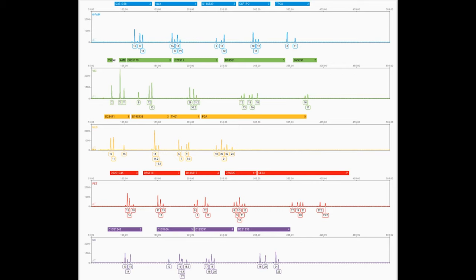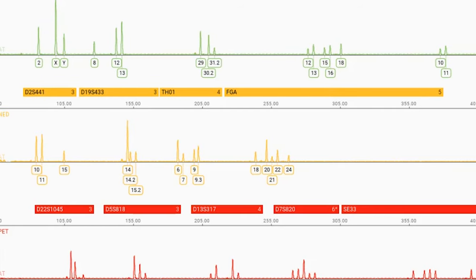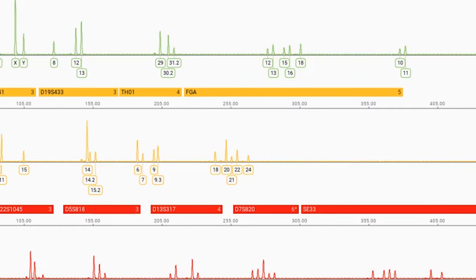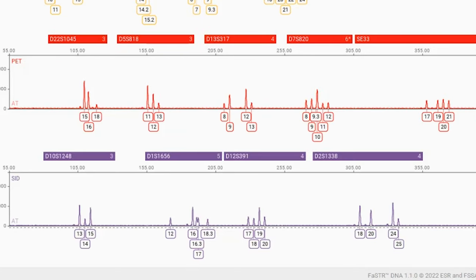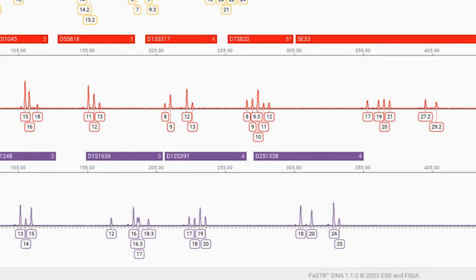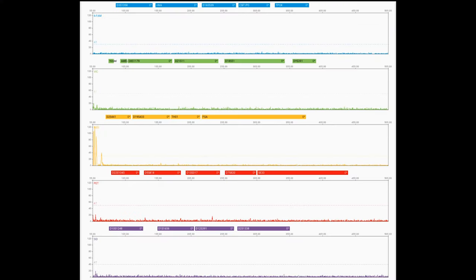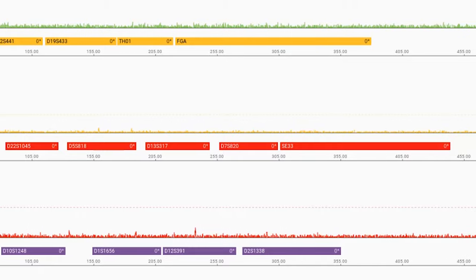Some mixtures are simple, while others are more complex. Depending on how many individuals are present and how much DNA each person contributed, it may not be possible to determine if a specific person is present in a mixture. Other DNA samples have no DNA at all or only a few peaks that are not enough to be useful.